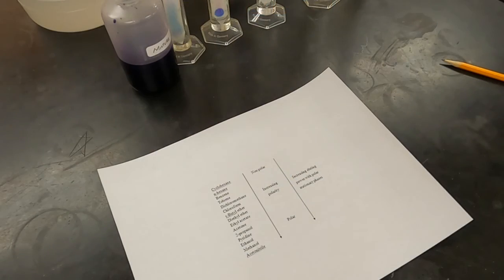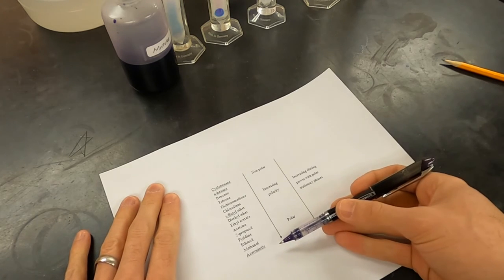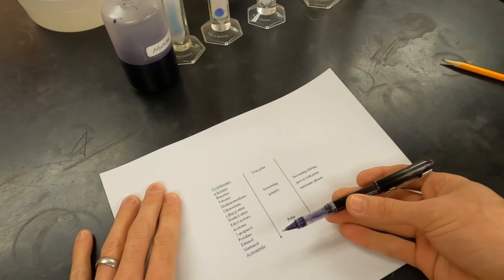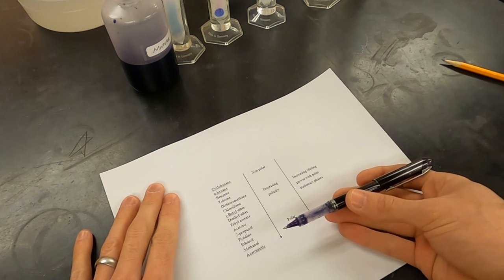Last, I'm going to summarize my results on a list of common solvents — how they worked, what they separated — and that will help me next time when I prepare a column for column chromatography.